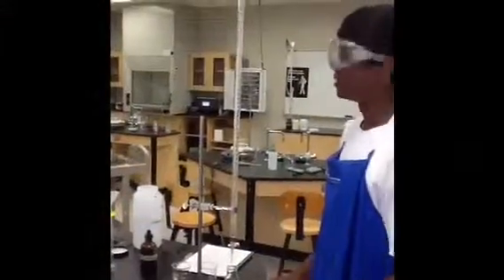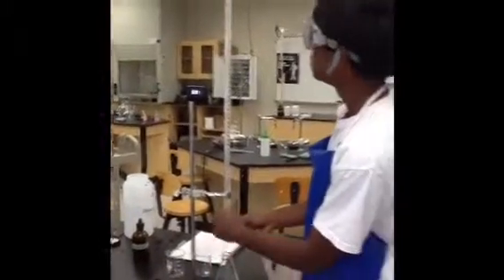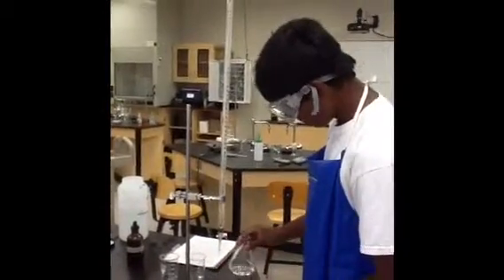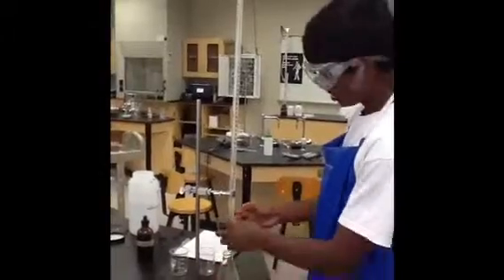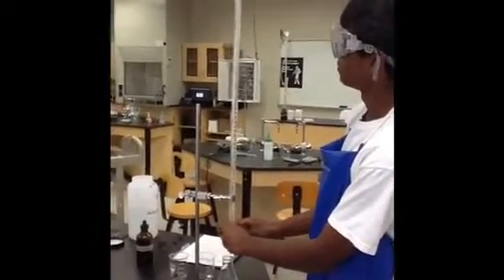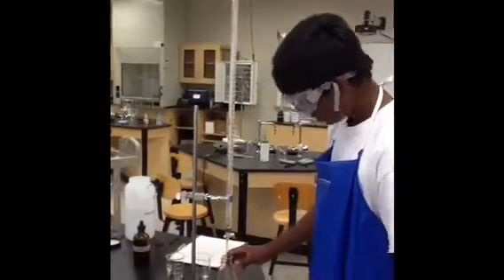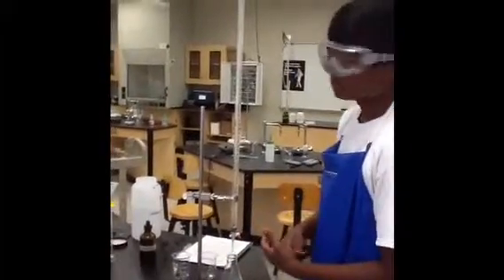So now guys, we're going to take this 1 milliliter at a time, and you're going to slowly add each milliliter. And you're going to shake it up, and you're going to notice a color change. If there isn't a color change, you're going to keep going, 1 milliliter at a time. There still isn't a color change, you're going to keep going, one by one.